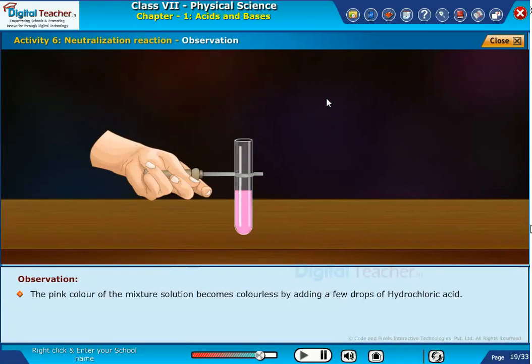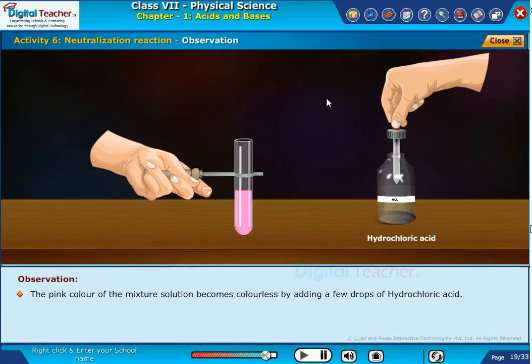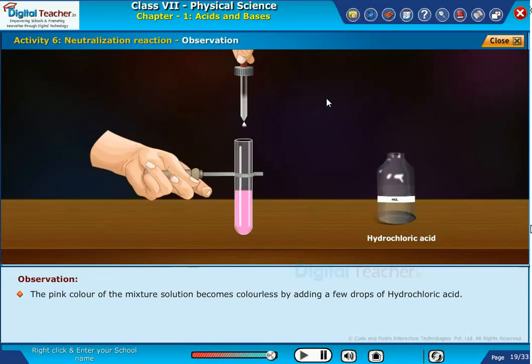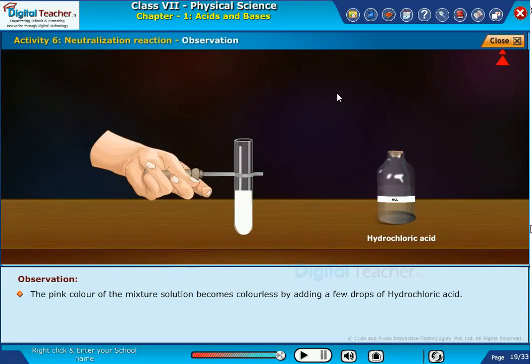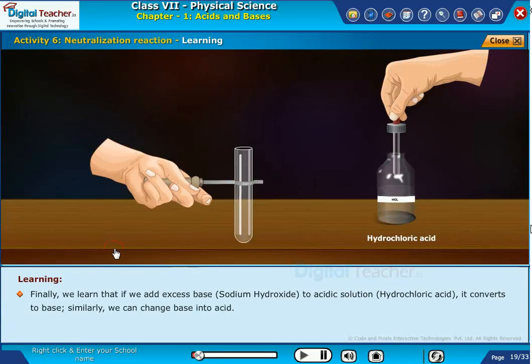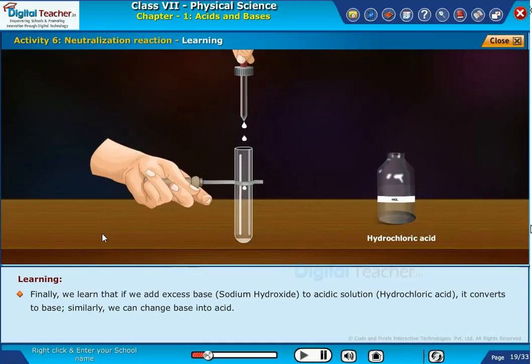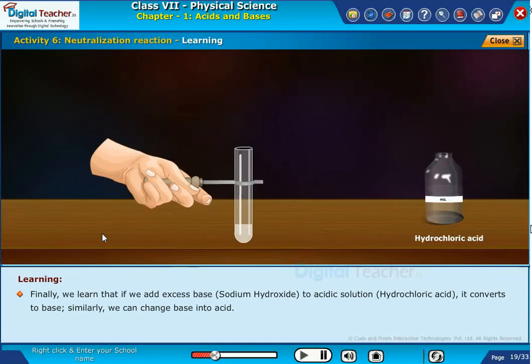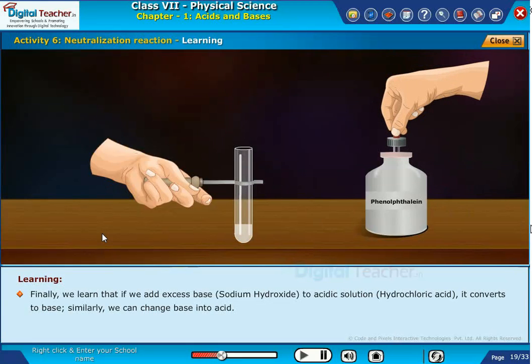The pink color of the mixture solution becomes colorless by adding a few drops of hydrochloric acid. Finally, we learned that if we add excess base — that is, sodium hydroxide — to an acidic solution — that is, hydrochloric acid — it converts to base. Similarly, we can change base into acid.